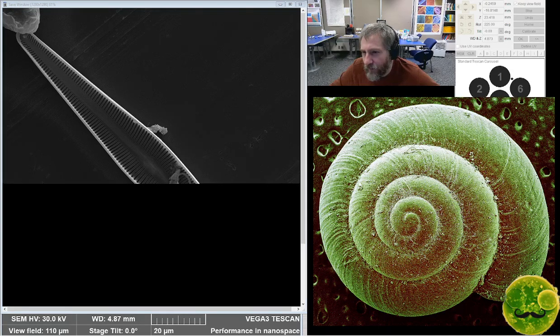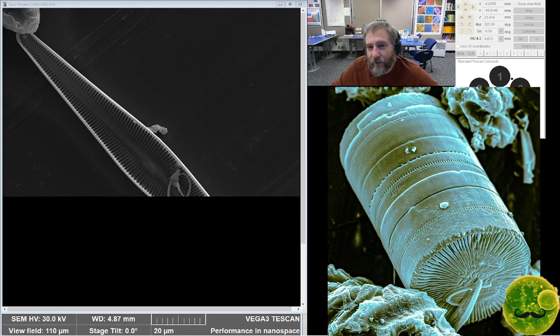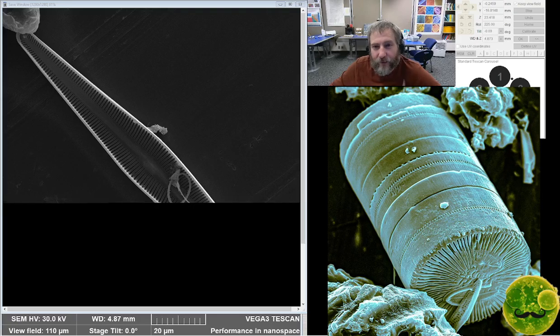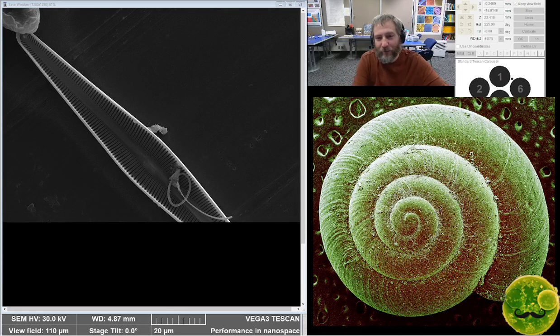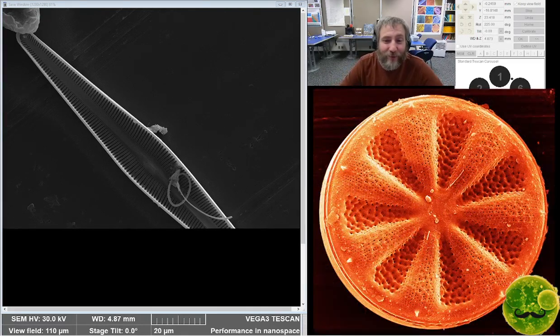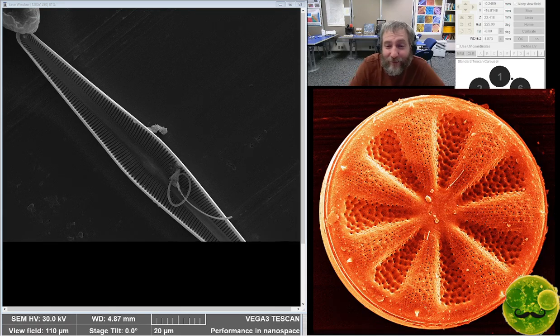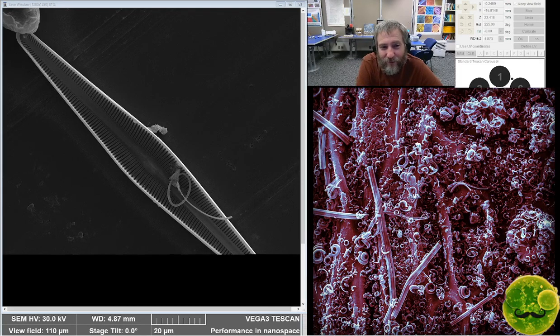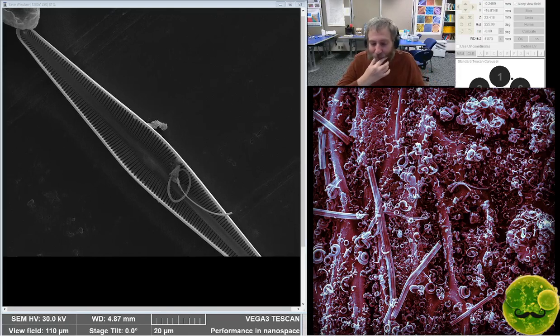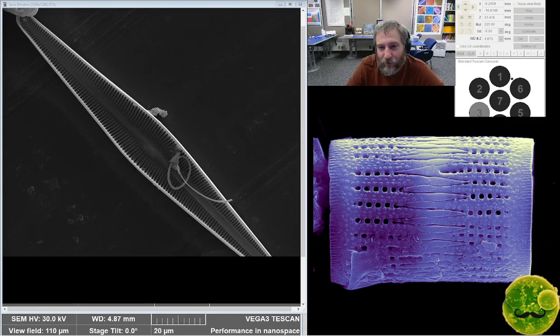Let's see. One more question. How come the pictures on the right side of your screen are colored? The ones on the right are images that I colored. That's sort of my artistic impression of the SEM image. The colors come out of the instrument black and white, and then I try to make them a little bit more appealing or interesting to people by putting false color into them. So that's an imaginary color. They're not even close to the real colors for those organisms because diatoms are mostly translucent. So they don't really have a color, although they do have a physical color sometimes. As light passes through, it gets refracted and deflected, and it will give them sort of a color.